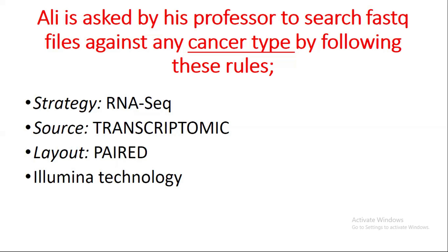Before the practical, suppose Ali is asked by his professor to search FASTQ files for any cancer type by following these rules. The strategy should be RNA-seq, the source should be transcriptomic — because we are dealing with messenger RNA — the layout should be paired-end, and the sequencing files should be generated through Illumina technology. Following these four criteria, we are going to search for data related to any type of cancer.